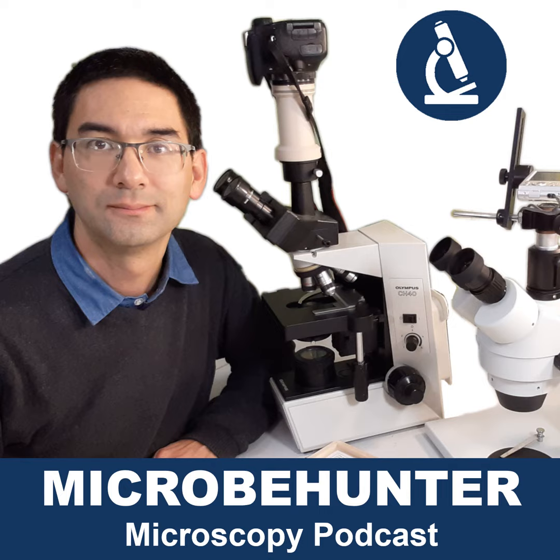Back in 1998, before I bought my microscope, I talked to several representatives of microscope manufacturers, and this was the time when the infinity optical systems started to be introduced. I asked the representatives of Nikon and Olympus, who just happened to be at the congress that I visited.